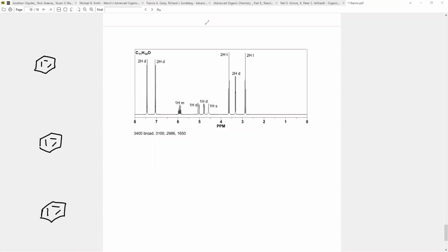The easiest one to see is when the hydrogens group like this. Why is this the easiest? Well, first off, this is symmetric. Let me put these in a different color, but these hydrogens are symmetric to these ones. Because of that, this benzene splitting pattern will give us a 2H doublet and a 2H doublet.